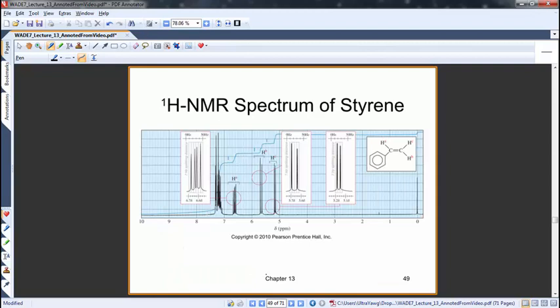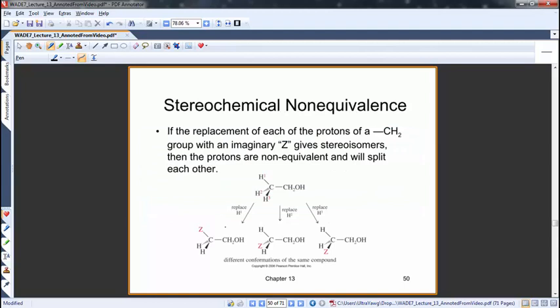Okay, so that's for the most part our proton NMR, and you can figure out the spectrum if you want. If you really wanted to look at it in detail, look at what the ring does in the aromatic region. All kinds of crazy stuff goes on. So there's lots of information to be gained there. I'm going to also briefly go over this as well, although I'm not going to get into it too much.